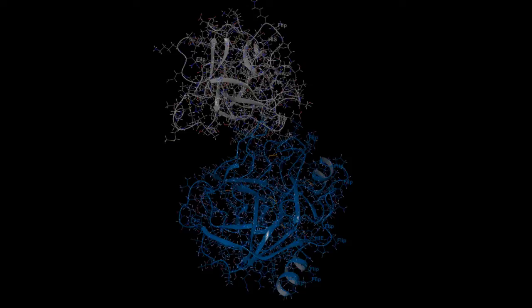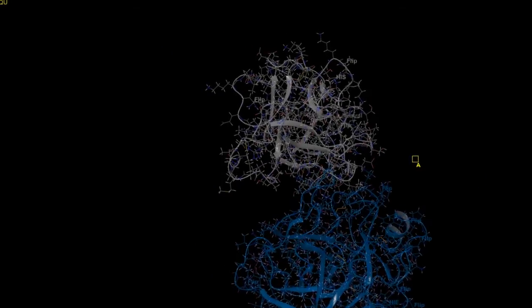Although it is not necessary to prepare proteins for docking, it may be advisable to do so, as proteins from the PDB often do not have coordinates for side chains on the surface or even for whole chains that are solvent exposed, as these are usually more mobile and can be difficult to determine from X-ray data. If these missing parts are not in the favored binding region the docking should still produce good results, however if the poorly defined parts are in the binding domain then running the protein preparation wizard can improve the results.